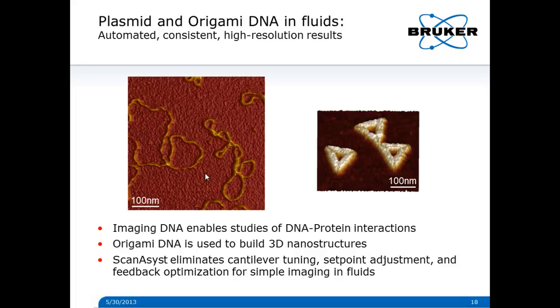In fluid, ScanAsyst is also very highly functional and automated, and so these are images of DNA imaged in fluid with ScanAsyst, and on the left here we have single strands of DNA. Imaging like this enables studies of DNA-protein interaction, but it's also just a great way to see how well your system is performing, and show that the forces are low.